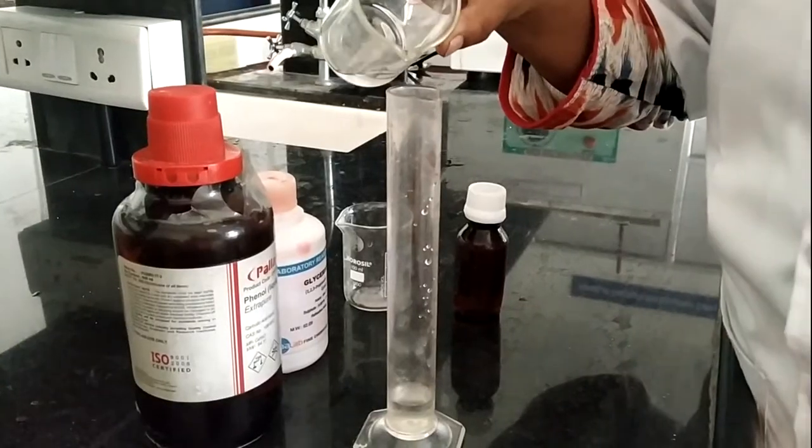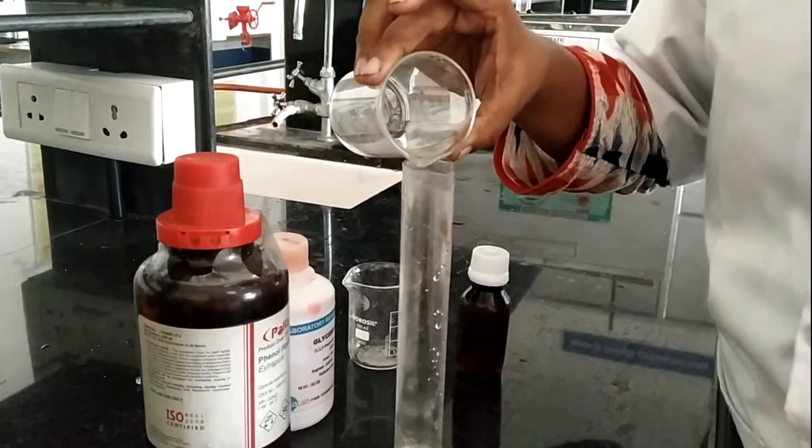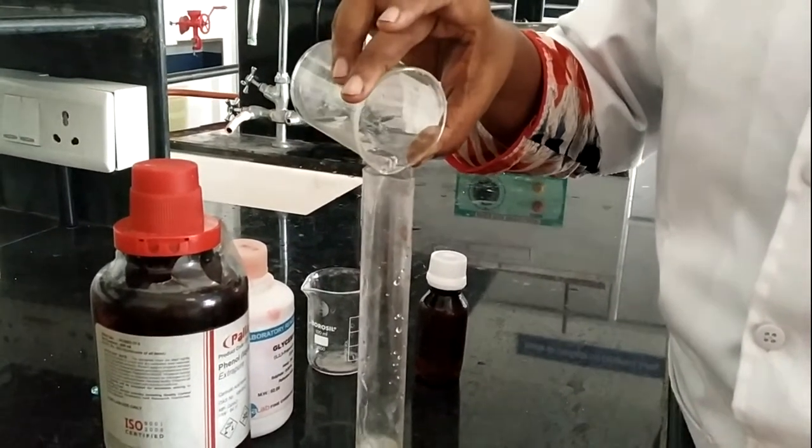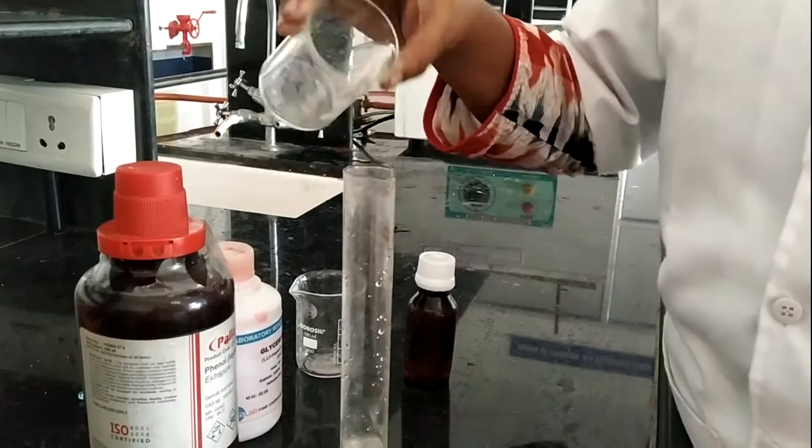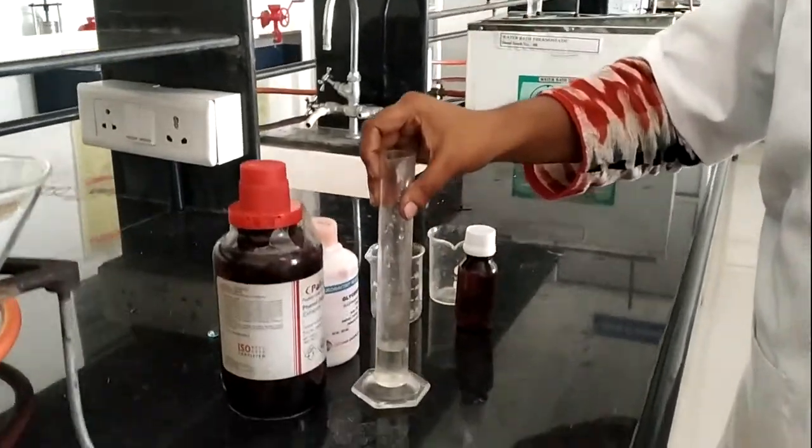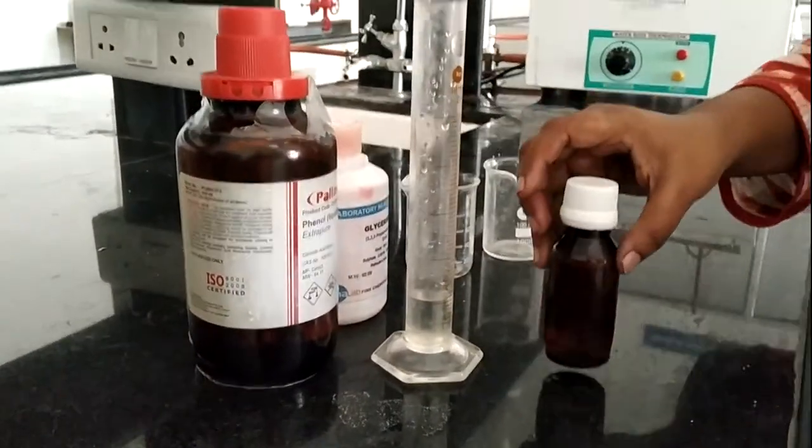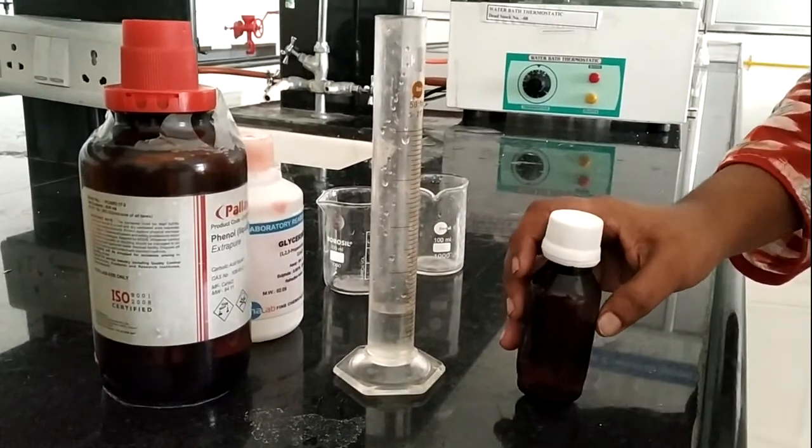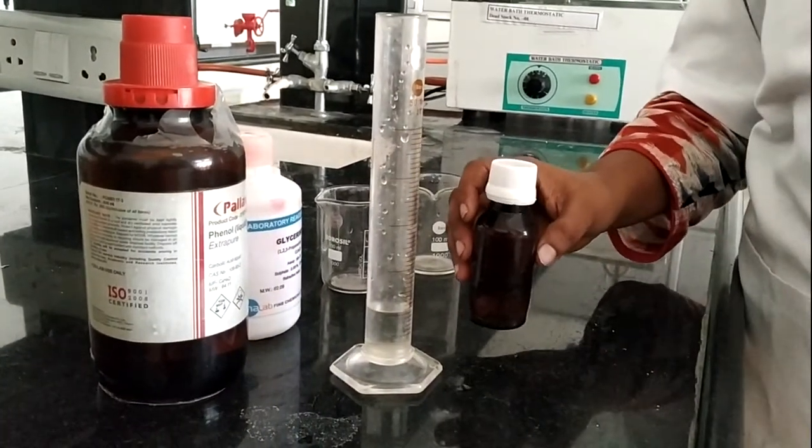After completely dissolving the phenol into the glycerine, we proceed for volume makeup in this measuring cylinder. Volume is properly made up to 10 ml. Now we will transfer our formulation into this colored fluted bottle and then proceed for the labeling part.